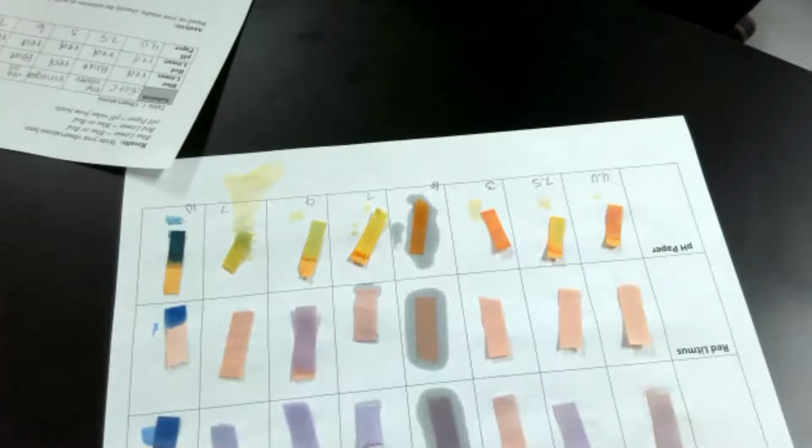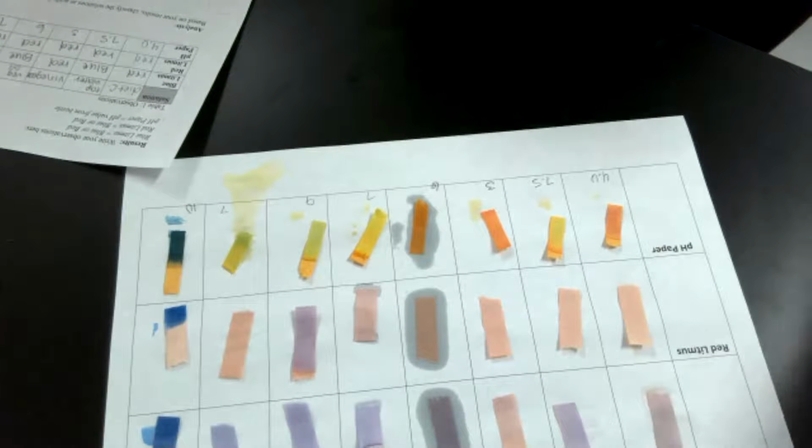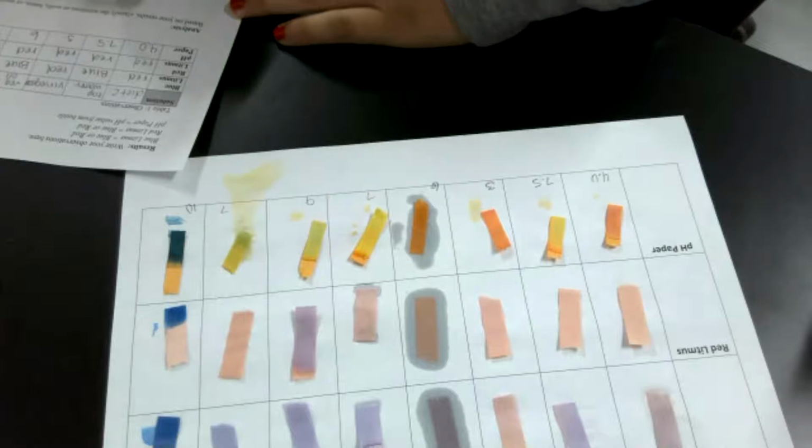But how do you know what's an acid? Less than 7 is an acid? 3, 7, well, if you look at it, it tells you.